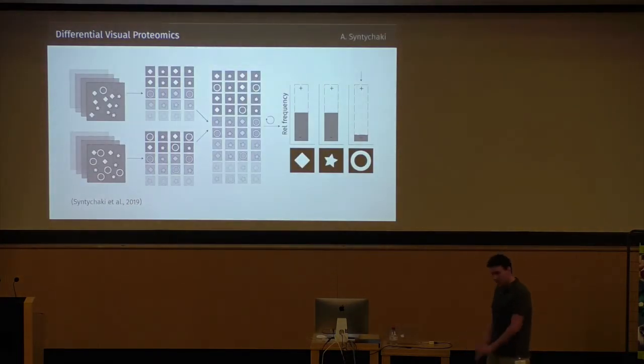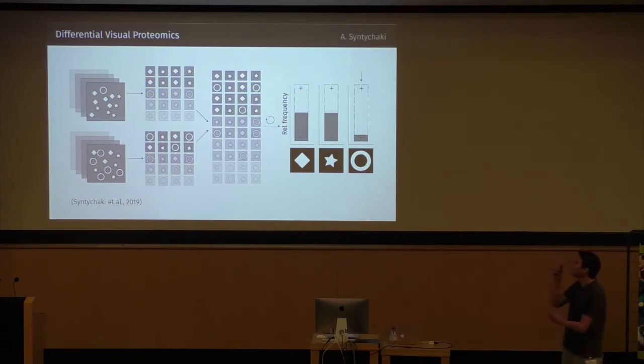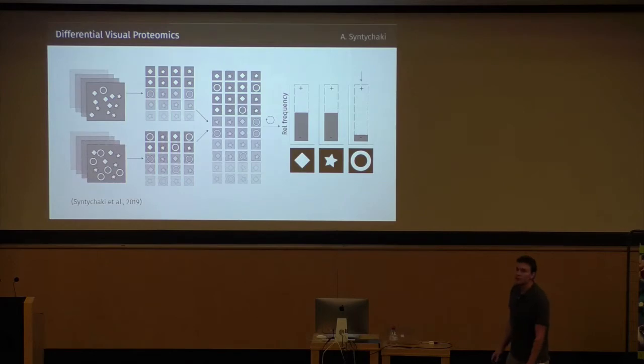What another PhD student of our lab is now doing is a procedure we developed that we call differential visual proteomics, where structures from different cells are classified and the abundance of the found structural classes are then compared to find differences in the proteome. In this schematic here, a negative and a positive control are classified, the structures are compared, and here, for example, you would have found a difference in this ring-like protein structure.